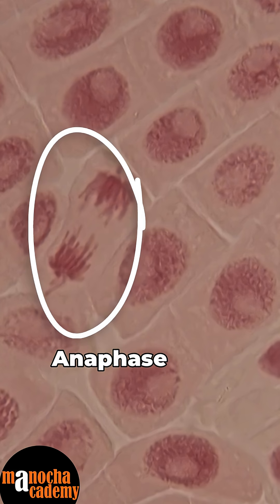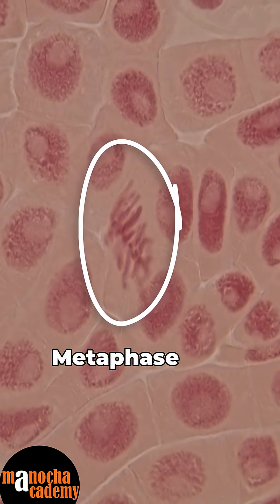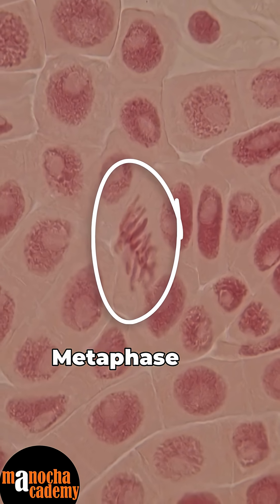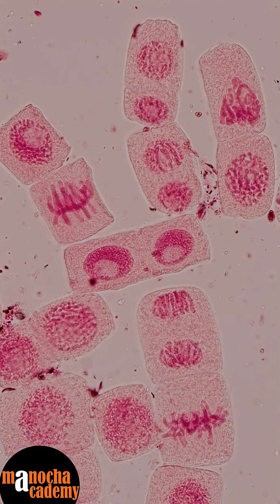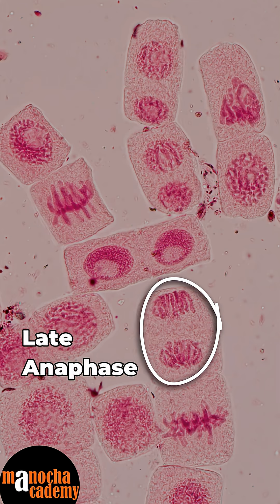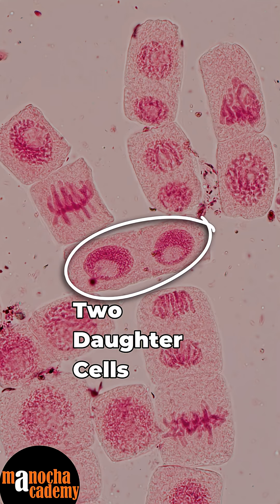How do you know that? Because the chromosomes are clustered towards the poles and they are facing the center of the cell. This is metaphase — the chromosomes are arranged at the center, and you can see the ends of the chromosomes are facing towards the poles. Now this is a field where you can see a late anaphase or an early telophase. You can also see two daughter cells have been formed and they have separated from each other after anaphase.